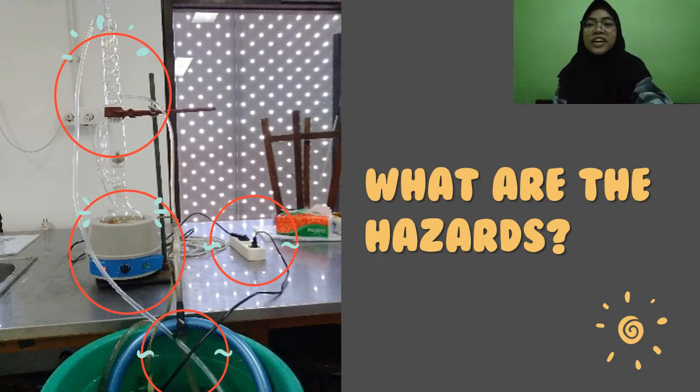Okay, so can you guys identify the hazard that's shown in this picture? Well, let me show you. First, this set of glass equipment consists of 3 components. There are condenser on the top, soxhlet, and the last is round bottom flask. This set must be supported by statives and clamps in order to stand upright. If the clamp is not tightly installed, the set is at risk of falling and the glassware will break.